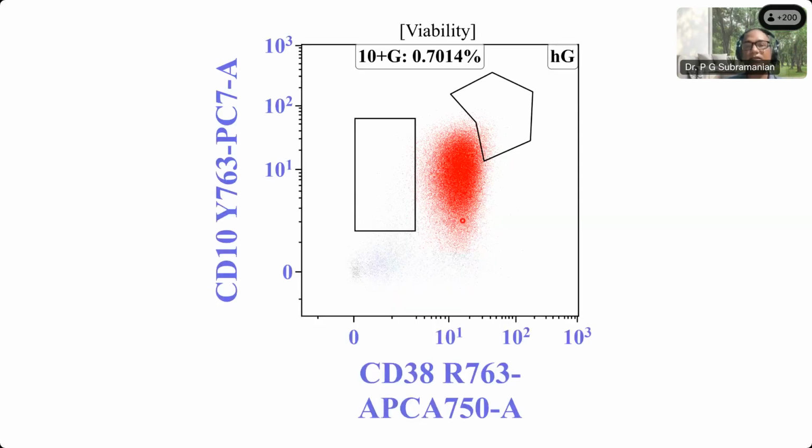So this is again CD10 moderate, CD38 moderate, as we have already seen. But here, this area is where we have marked the position where, in our lab, normal hematogones will have a uniform CD10 and CD38. So they fall over here. When we look at the expression of various markers, we try to compare it with their corresponding normal. So here CD10 is nearly there as compared to normal, but it is slightly dimmer than normal.